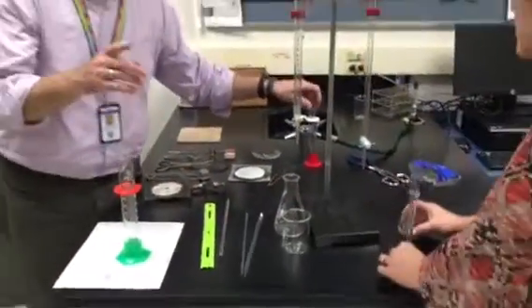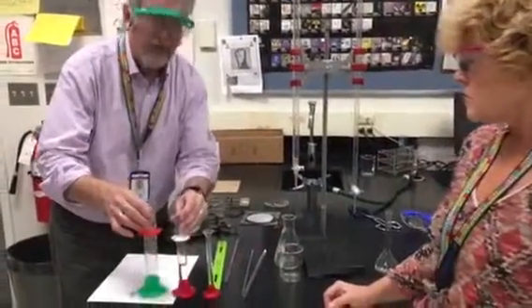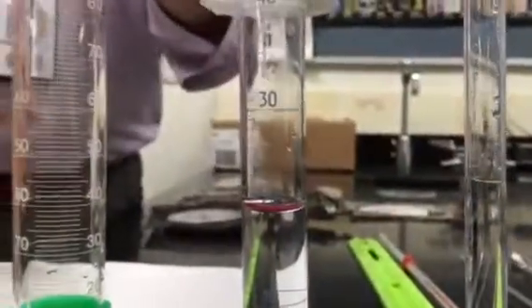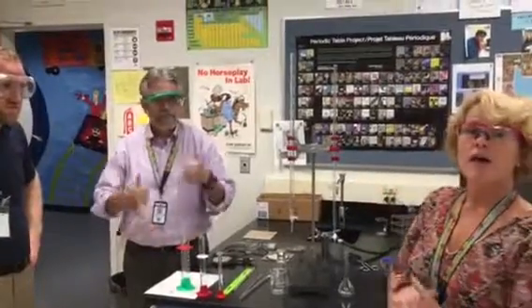One last thing that I'll say is be very careful. Don't assume that all graduated cylinders are going to have that same level of precision. Notice all of these are different. So every time you use a graduated cylinder, you have to look at that scale. Okay, that's it for measurement. Good introduction. Good luck on the quiz next week, which will have these different instruments on it, and you'll have to read the scales. Okay, take care.